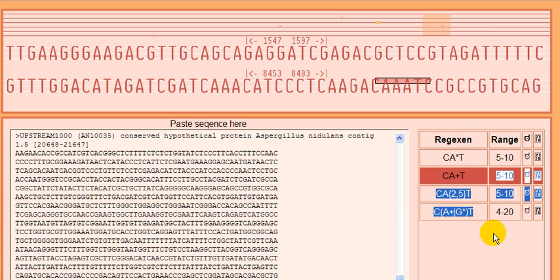Okay, this defines a range, and we can visually see that as well. So click here and it takes us to the visual representation. So that's it. Similar to the star quantifier, except that you can only have between 2 and 5. A's must be between that range. From 2 to 5. It cannot go below or above that range.